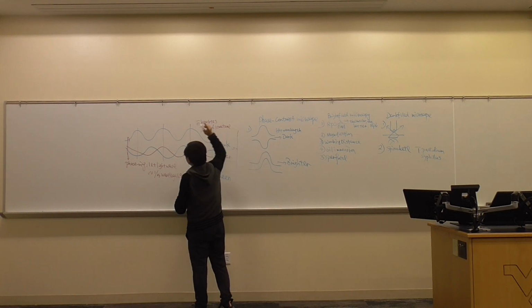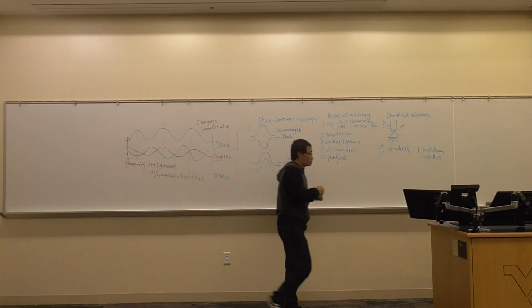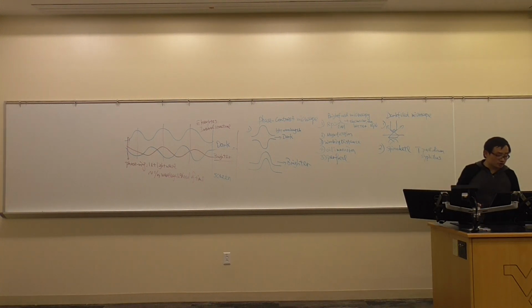Therefore, we came up with this very magic phase ring. It changes the light wave, and this is what it looks like. So you can see this is an amoeba, and this is Paramecium. You can briefly see the internal structure, what it looks like, without even doing staining. So that's a very magic tool.